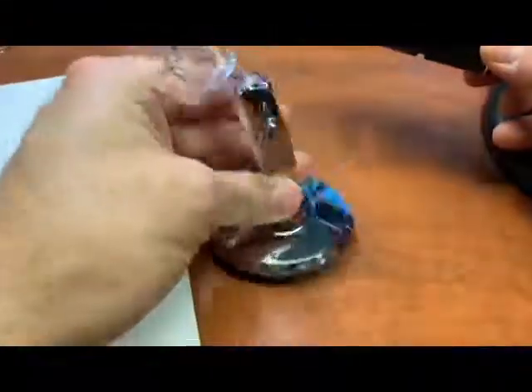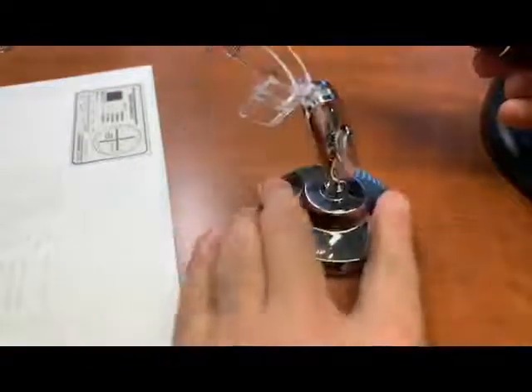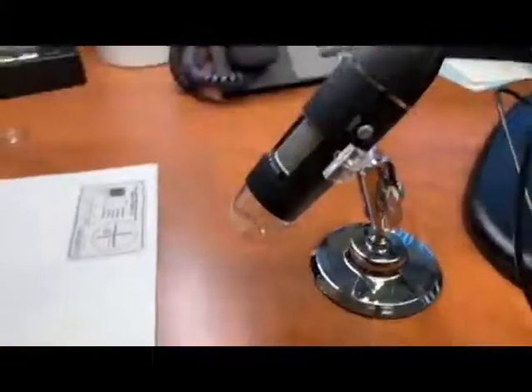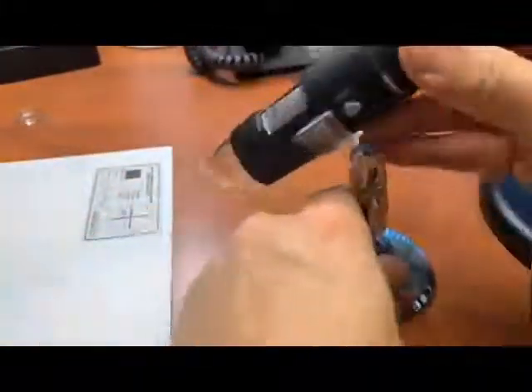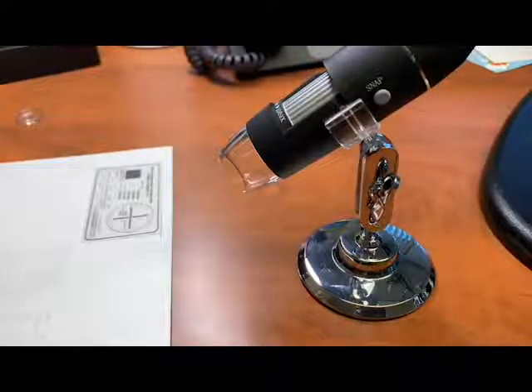The stand is a little lightweight overall, but it's easy. Whenever I've had to use it, I've always had to hold it down whenever I'm making my changes, but it just clicks right on there and clicks off very easily, just like this. It is a lightweight plastic base, so I might look at something a little bit heavier, but overall it works well, and I'll show you some video of it, how I was testing it.